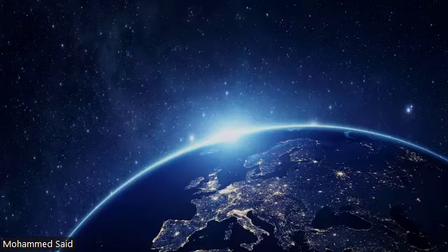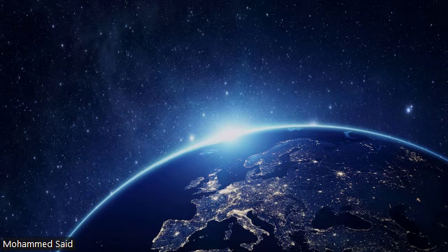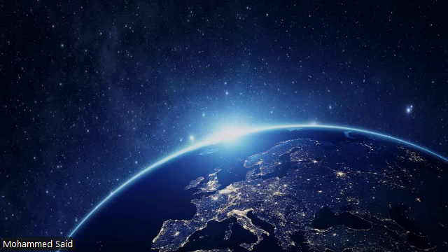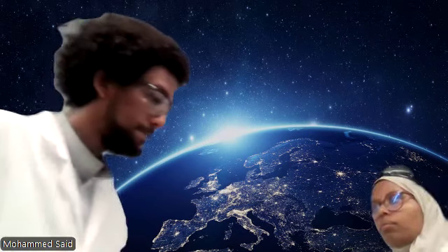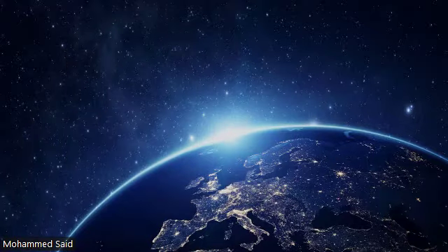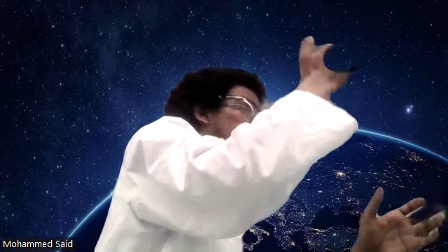Sorry, I'm gonna grab these two. These are not there. These are for waste. So after you use them, come with a pipette tip top. We use those. Okay.